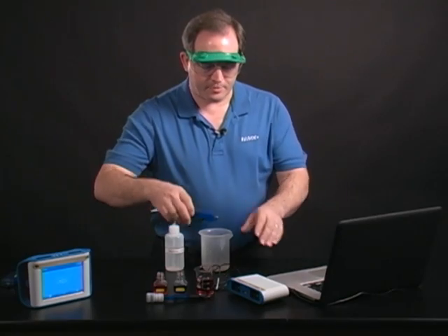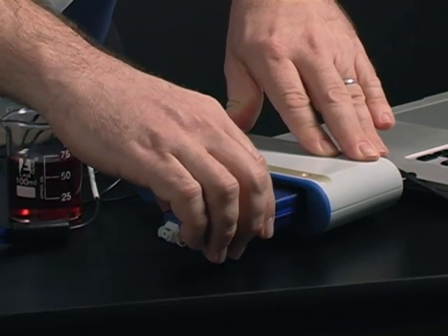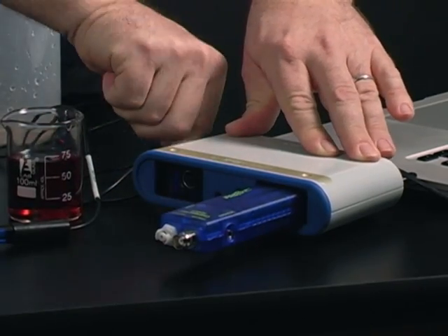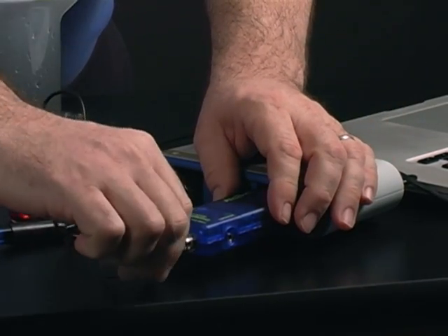I'm going to use the chemistry sensor and connect it to my SparkLink. Then I'll take the probe and connect that to the end of the sensor.